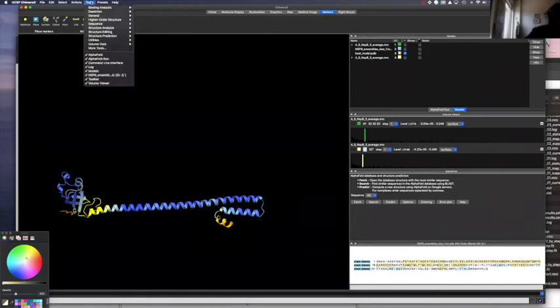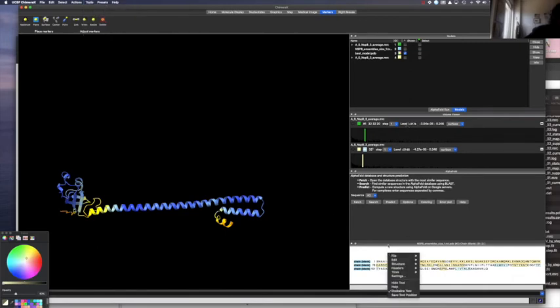So, here we go, tools. You have the possibility to select tools such as AlphaFold that you are directly linked to. And when you have a sequence, you can go to tools here and say AlphaFold calculation.